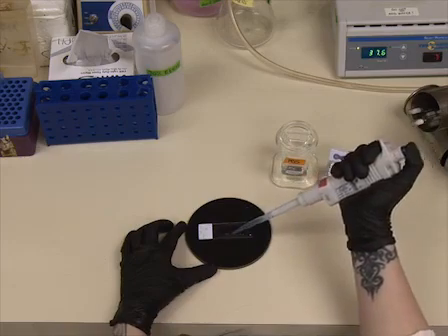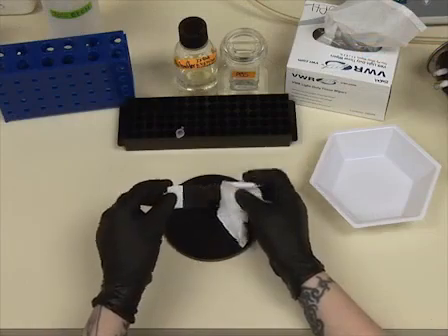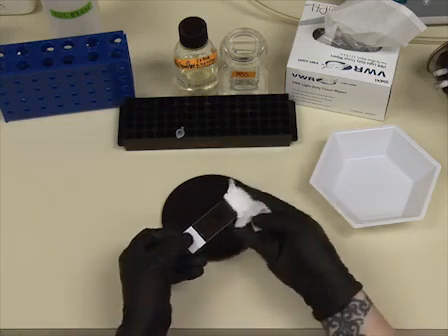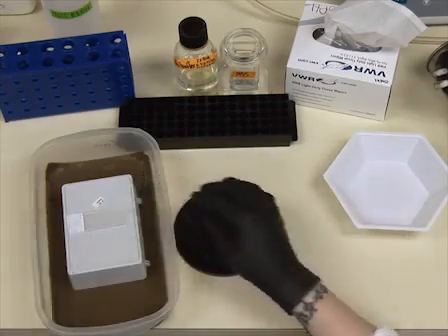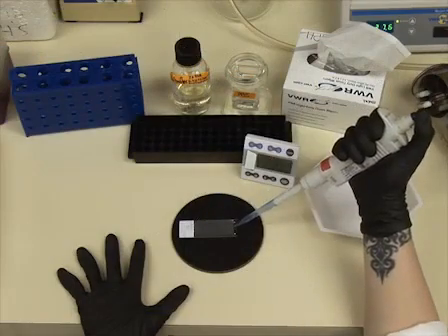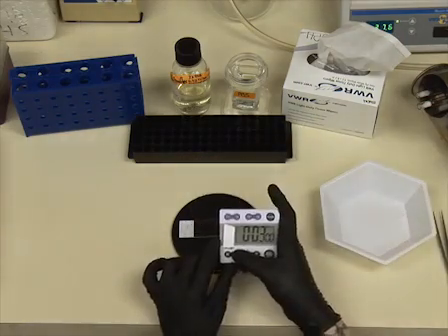Thaw the slides by applying PBS and allowing to warm to room temperature for at least 5 minutes. We use antibody buffer that contains 0.3% Triton X100 for permeabilization and 3% bovine serum albumin for blocking. Dilute your primary antibody appropriately in this buffer and incubate in a humid chamber overnight at 4 degrees. Use PBS to float the parafilm off the neurospheres and carefully remove it using forceps. This is the first of 4 5-minute PBS washes.